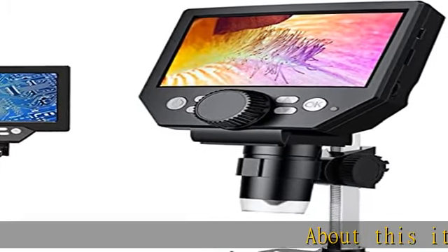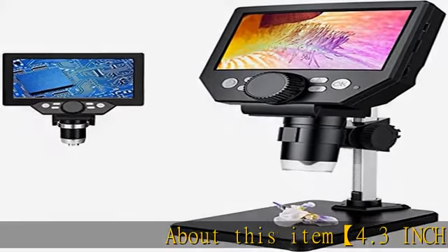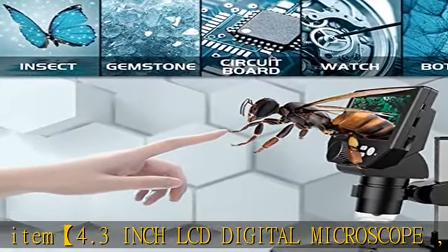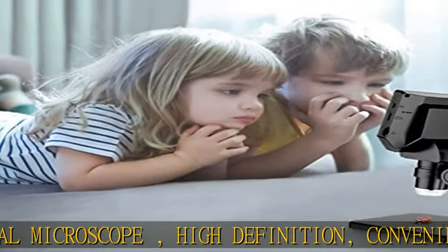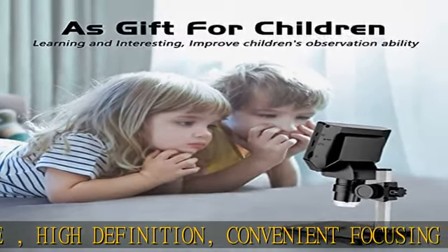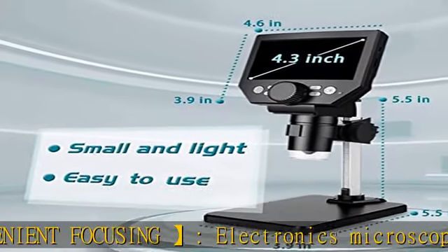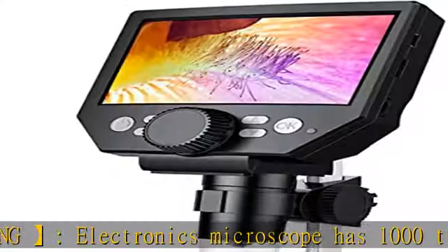This 4.3 inch LCD digital microscope is a high definition, convenient focusing electronics microscope with 1000 times magnification and 1080p/720p resolution. It has a USB connection. Adjust the object to the lens and slowly turn the focusing wheel to see the fine details.